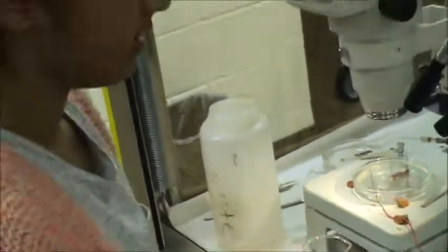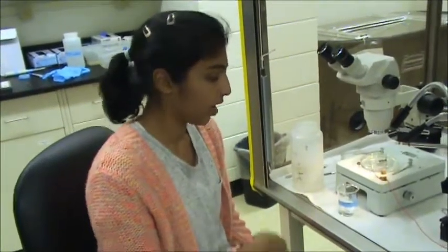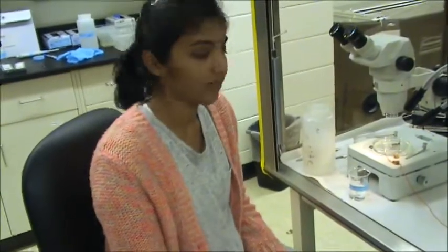And after you did that, we can stab the muscle again 3 times and then wash it out with another solution and stab it again, and keep doing that until you have all of your trials in.